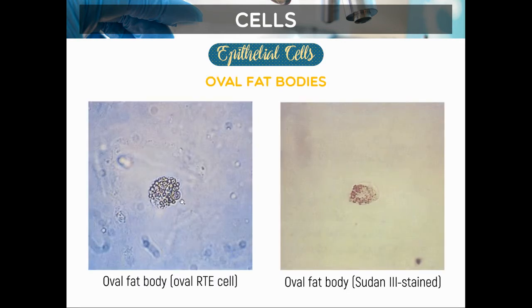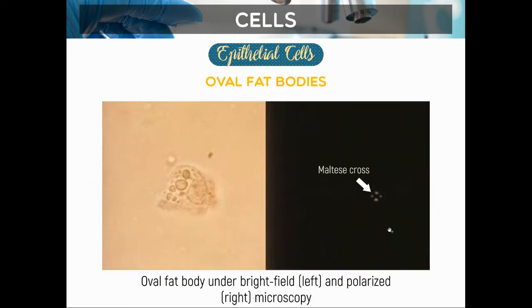Here we can see oval fat bodies stained with orange-red droplets, confirming neutral fat or triglyceride. Under bright field microscope we see the oval fat body, and under polarized microscope the Maltese cross pattern confirms the presence of cholesterol. Next, we have bacteria — they are small spherical (cocci) or rod-shaped (bacilli) structures. Their identification error is amorphous phosphates and amorphous urates, which can clump together in large numbers. The clinical significance is UTI. The major bacteria responsible for UTI is E. coli, which is bacilli in morphology.